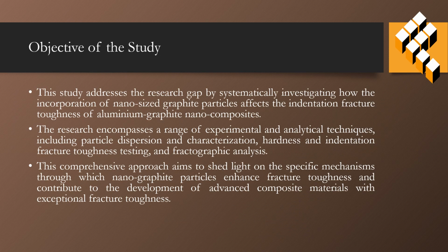Objective of the study. This study addresses the research gap by systematically investigating how the incorporation of nano-sized graphite particles affects the indentation fracture toughness of aluminum-graphite nanocomposite. The research encompasses a range of experimental and analytical techniques, including particle dispersion and characterization, hardness and indentation, fracture toughness testing, and fractographic analysis.